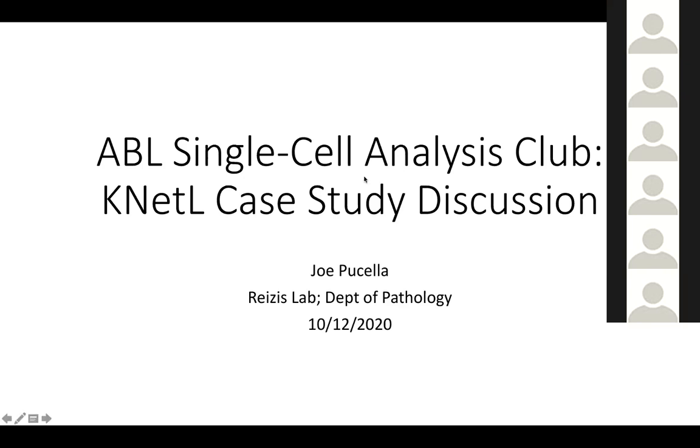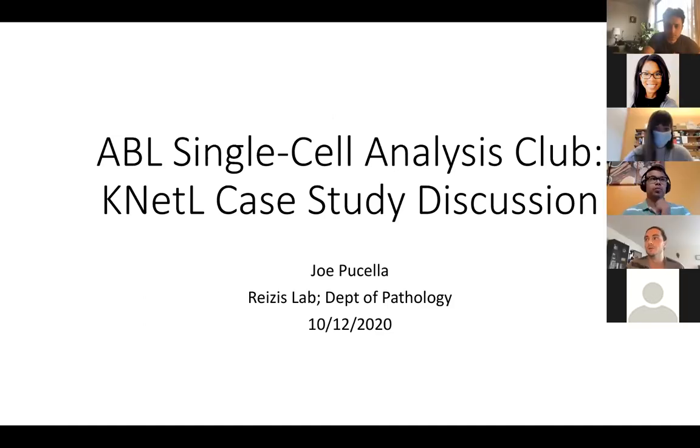So what I want to share with you all today is some more case studies, some more examples of how to put this to use, and in my experience, how using KNetL over UMAP and tSNE has really been transformative for all of our studies. And some of the data that I'll show you today is actually being packaged together as we speak, and we're submitting a manuscript on this shortly.